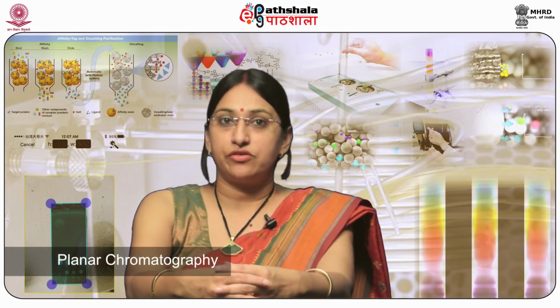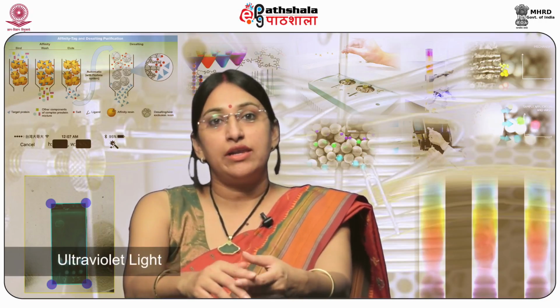chromatogram. Visualization methods in planar chromatography. In planar chromatography, the identification of analyte molecules is done on the basis of their visualization. If the molecules are in themselves chromogenic, then they can be observed directly on the chromatogram. However, if molecules are colorless, different visualization methods can be used to render the sample spots visible. Such visualization methods can be ultraviolet light.